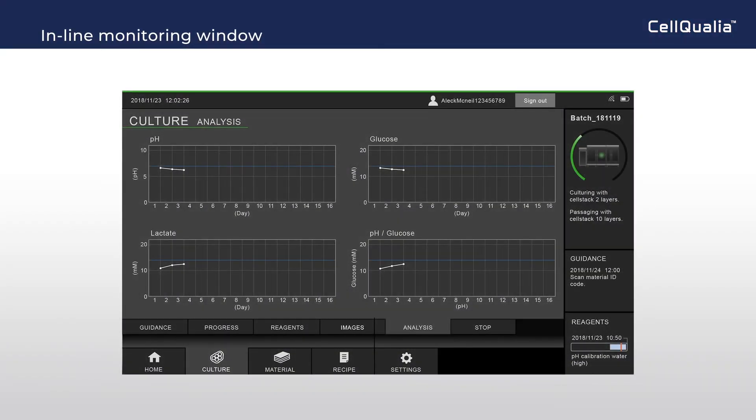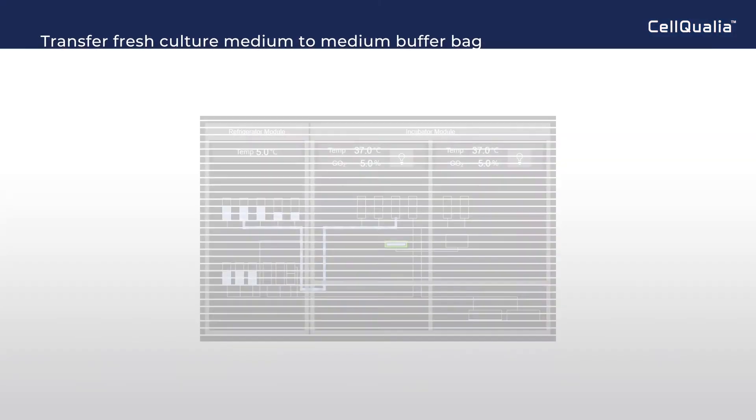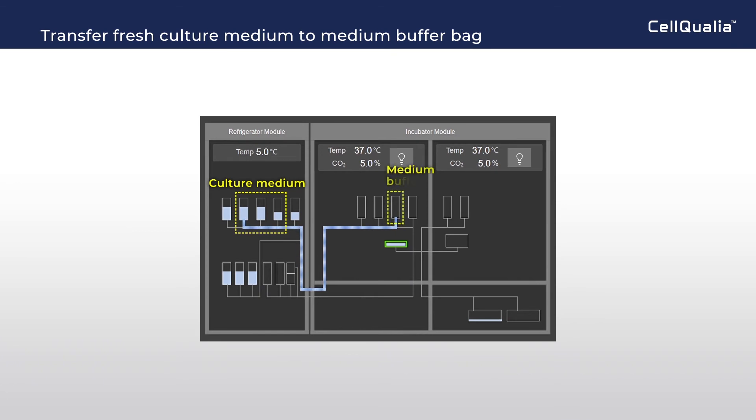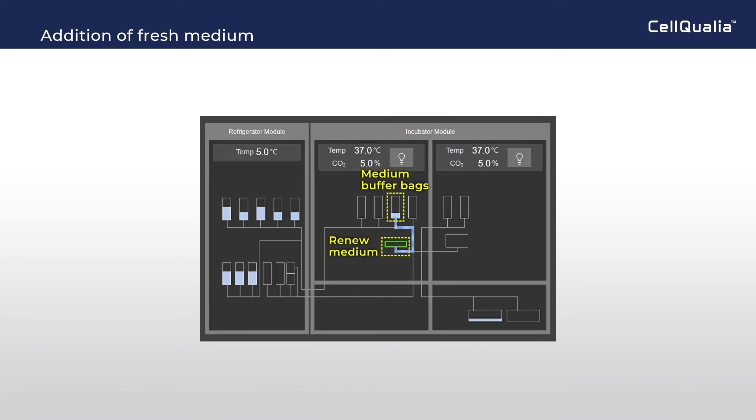In the inline monitoring window, the time course of pH, lactate, and glucose in the media and their ratio can be confirmed. Before medium change, the culture medium is transferred to the medium buffer bag for warming up. At medium withdrawal, medium is sent to the inline sensor and sampling bag for analysis. Fresh medium is sent from the medium buffer bag and transferred to the flask to renew the culture medium.